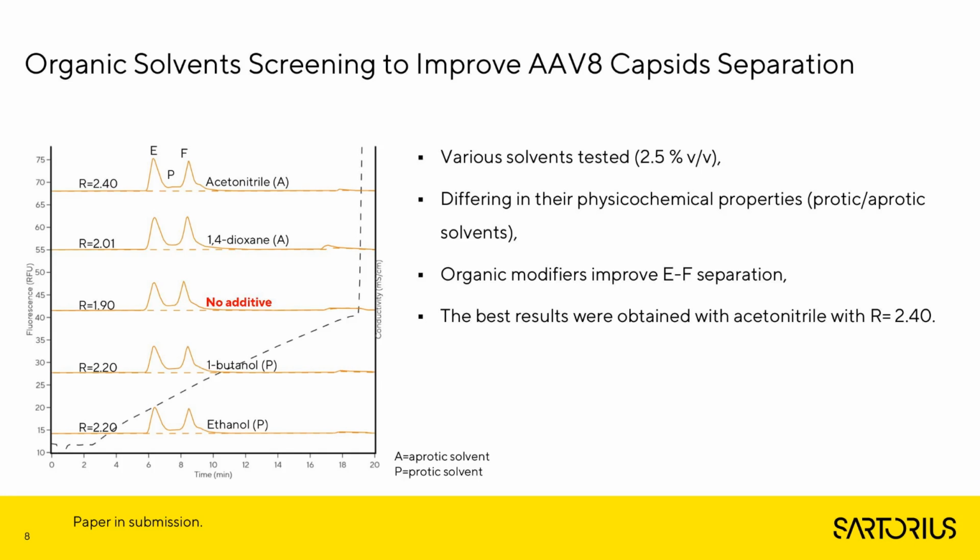There were also two other reasons we selected acetonitrile. It is miscible with water in all ratios, and it enables decent solubility of various salts.